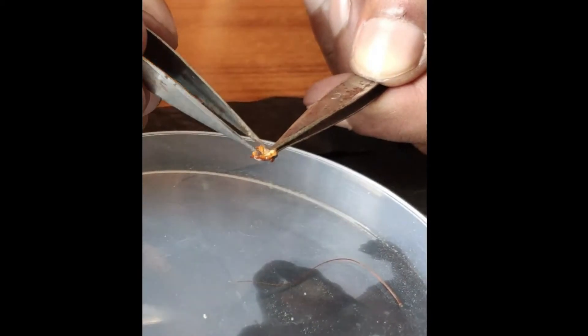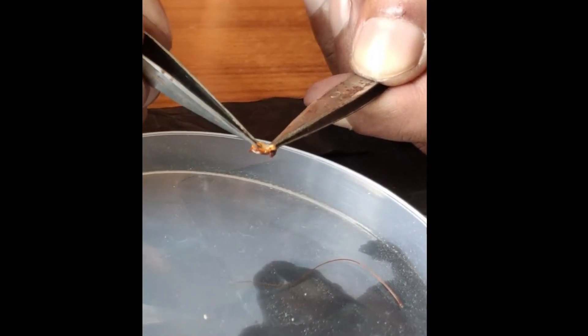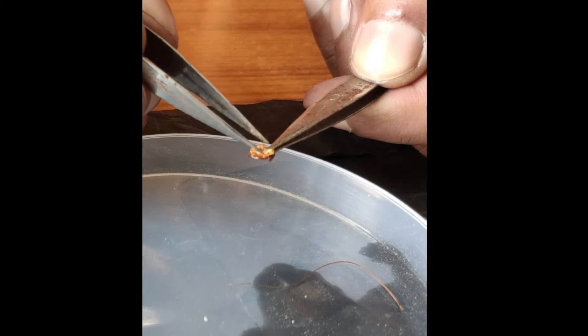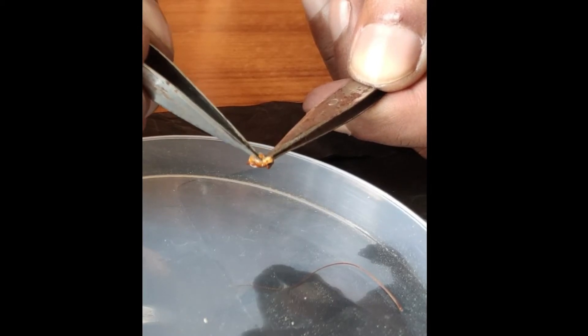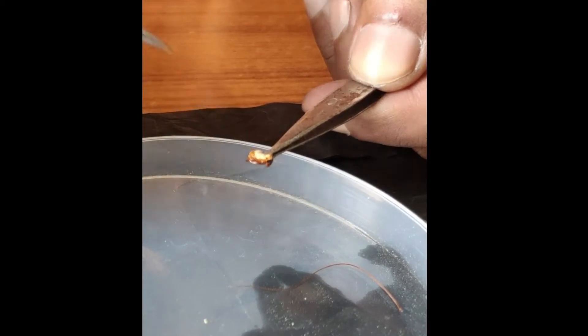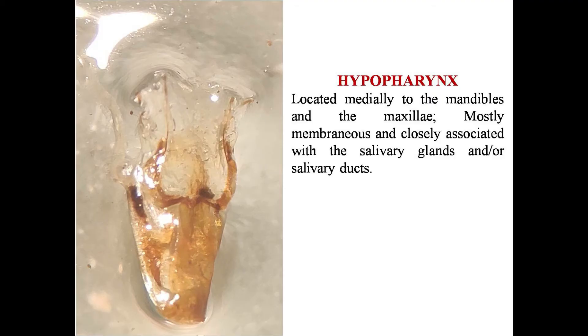Now we can see that the mouth cavity is open, and the muscular structure being touched by the forceps is the hypopharynx, located right at the center of the mouth cavity. I have to pull that out and place it on the slide. This is the hypopharynx.